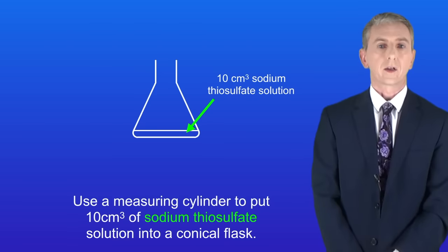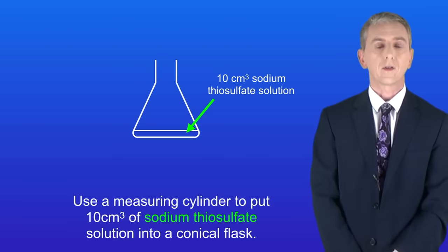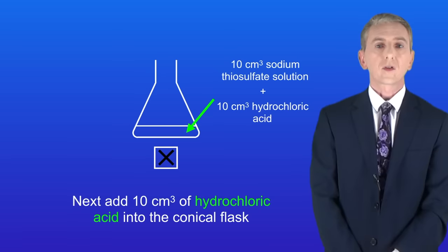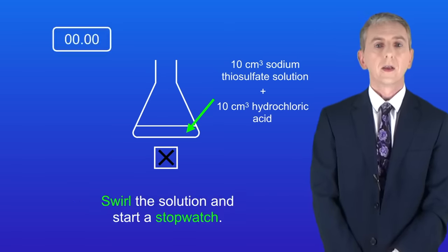First we use a measuring cylinder to put 10 centimeters cubed of sodium thiosulfate solution into a conical flask. We then place the conical flask onto a printed black cross. Next we add 10 centimeters cubed of hydrochloric acid into the conical flask. Now we swirl the solution and start a stopwatch.